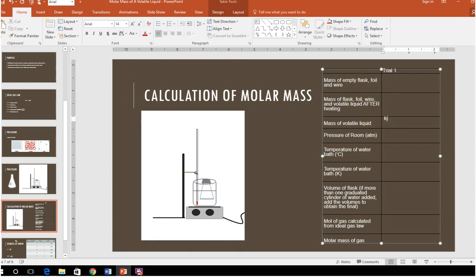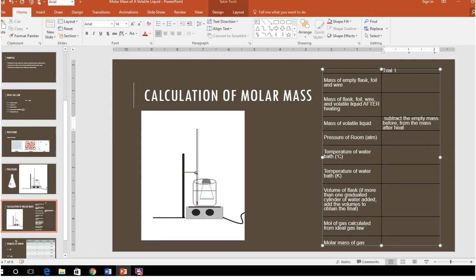So to get the mass of the volatile liquid, all you're going to do is subtract the empty mass before from the mass after heating. It's going to be a relatively small number, something on the order of like zero point something.